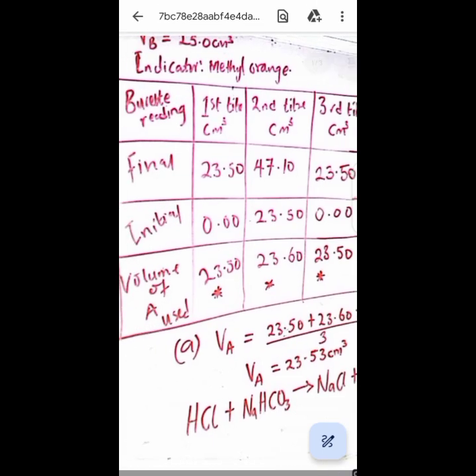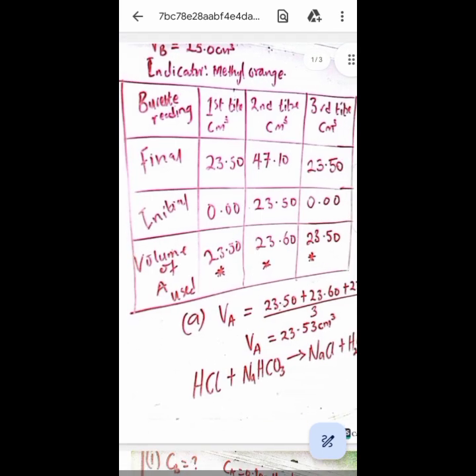But one thing is before you draw your table like this, you just have to write the volume of pipette used, which is 25 and the type of indicator used. Then we now have the three tables.